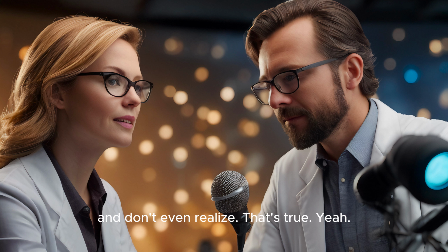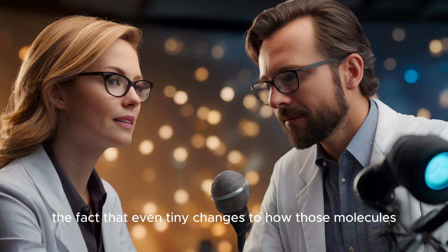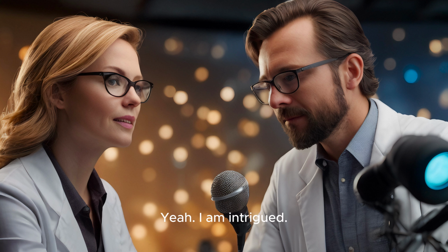We're so used to polymers being everywhere. We rarely think about the fact that even tiny changes to how those molecules are arranged can completely change a material's properties. So the research we're looking at focuses on polystyrene. Think like disposable cups, packing peanuts, that kind of stuff. And it really digs into the challenge of separating its different isomers. I am intrigued.